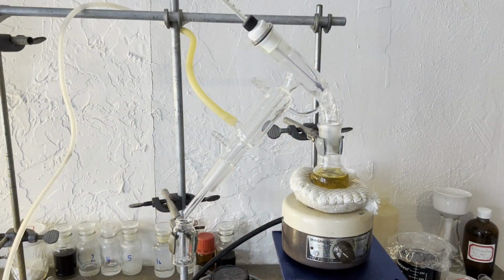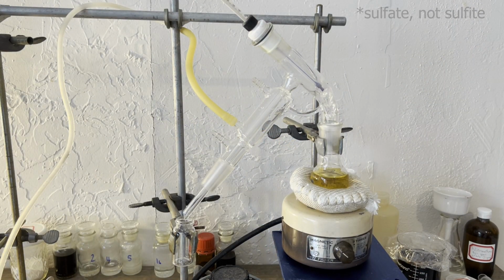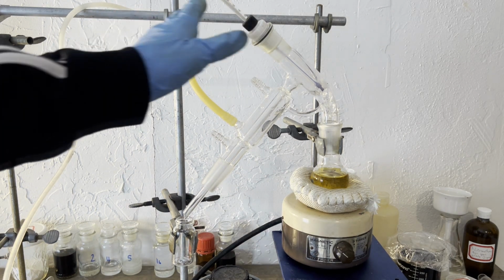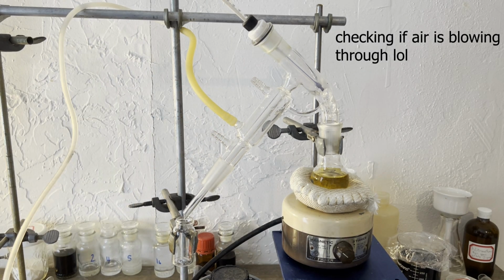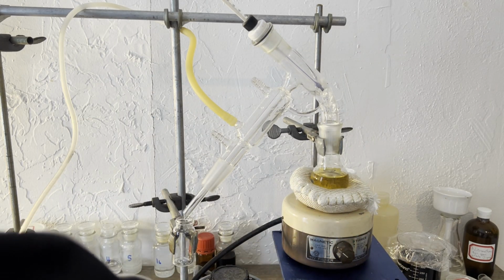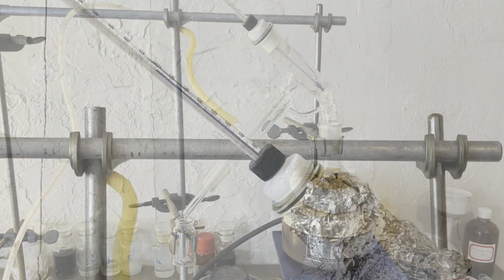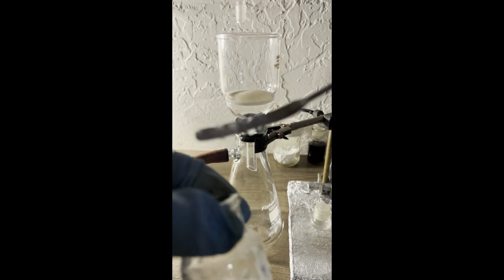I did a short path fractional distillation on the magnesium sulfate dried, filtered organic layer with an air-cooled condenser instead of a water-cooled one. The lowest boiling compound of the crude mixture is chlorobenzene, which boils at like 131 degrees, so air cooling is sufficient. This condenser is one of the more expensive pieces of glassware I own, so I try to minimize subjecting it to thermal stress. I'll show the fractions in a little bit.